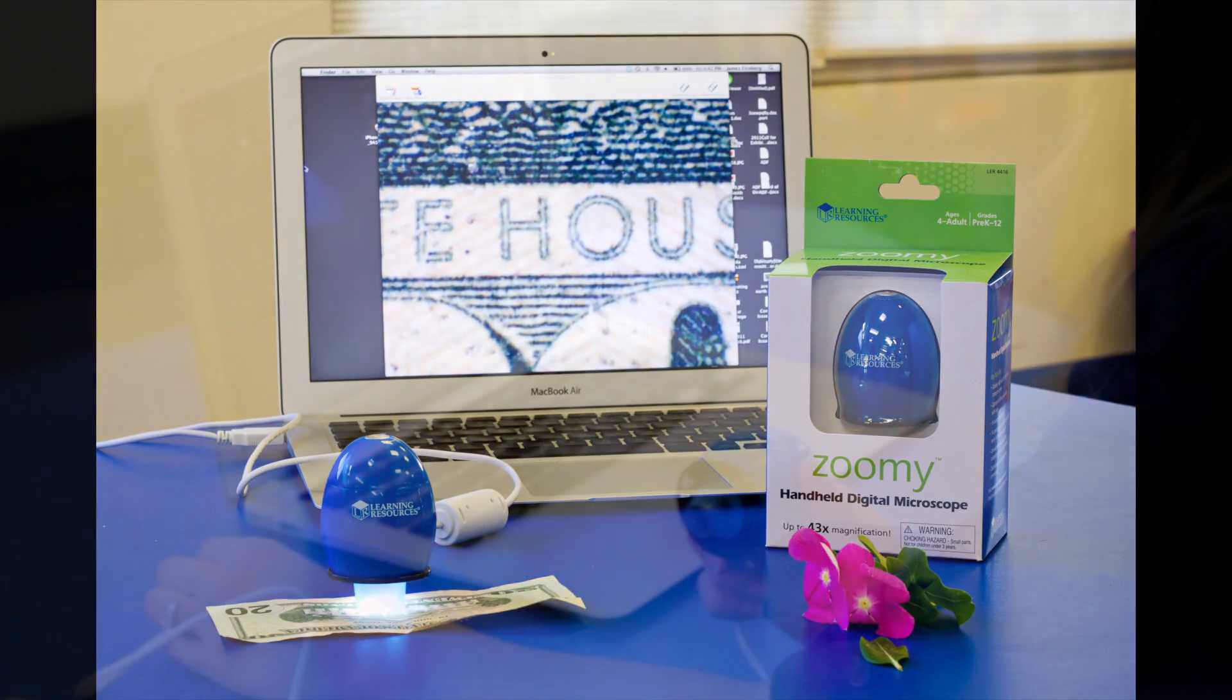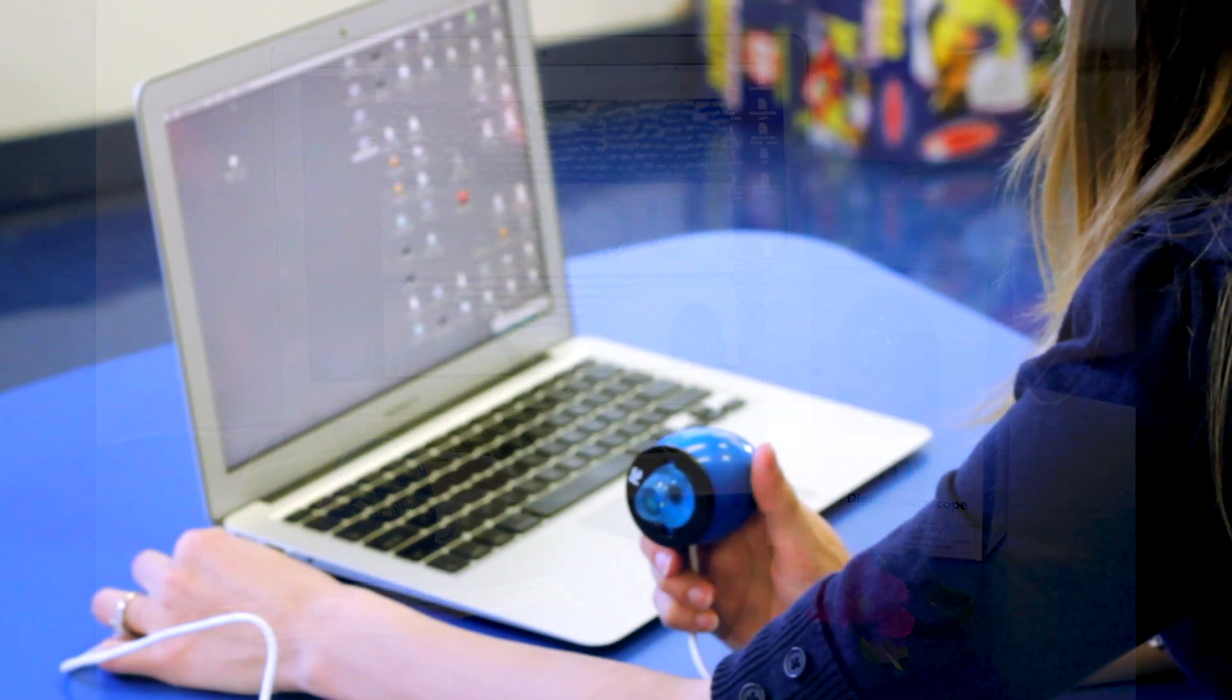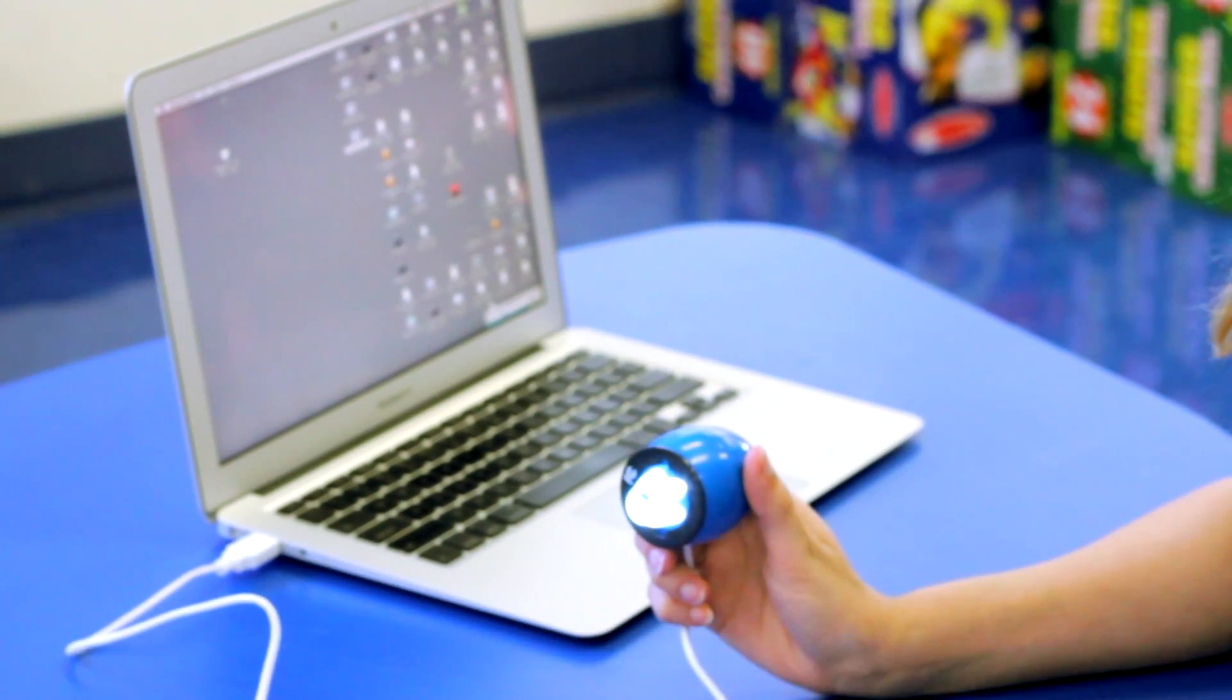Just load the software, plug the USB cord into your computer and you're ready to go. No batteries required.